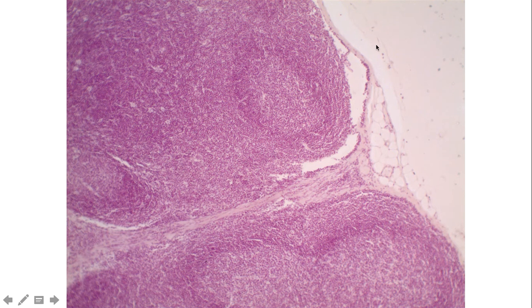And so the fluid is coming in and it's moving itself slowly through these small little clear spaces. And as it moves through these spaces, it's going to be, again, likely monitored by these lymphocytes. The small little clear empty spaces in the cortex are referred to as the cortical sinuses. Sinuses in this case are referring to these small little channels for this lymph fluid to pass through. And so the sinuses of the cortex are the cortical sinuses.